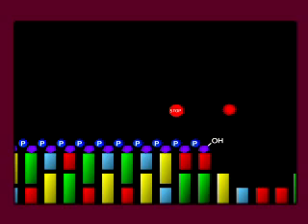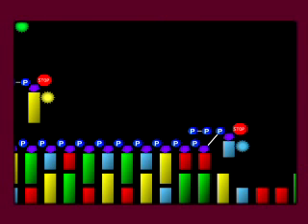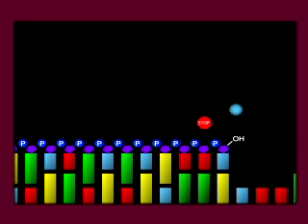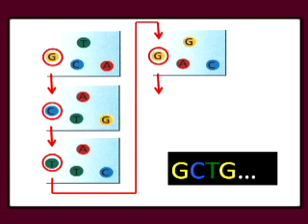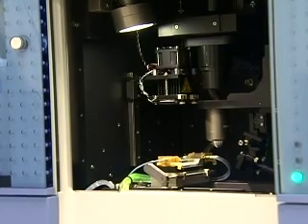That's a lot like the old sequencing method, but with the old method, the cycle couldn't continue after you added the dye terminators. How is this different? The major difference is that after the first cycle, the dye and the terminator are both removed. Then another round of reaction mix can be run over the flow cell, and another base can be added and detected by the camera. Then the dye is removed along with the terminator block. The camera records the timing, color, and position of each light flash, so the sequence of the bases can be determined for each cluster. The flow cell is attached to tubes that deliver the reagents.